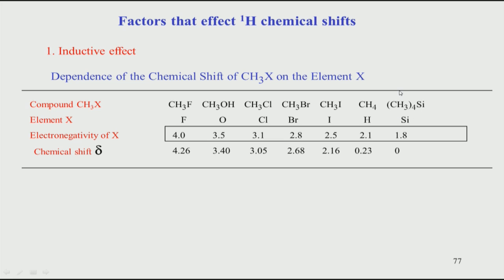So, that has been designated as a reference all over the world, and with respect to that reference, you calibrate. So, we use the word calibration. Calibration is basically deciding first, setting the chemical shift of the reference to 0, and with respect to that you can measure any other chemical shift. So, the point to drive home here is that the chemical shift reference is in a way an arbitrary concept. You arbitrarily decide one particular hydrogen atom as a reference and measure everything with respect to that.